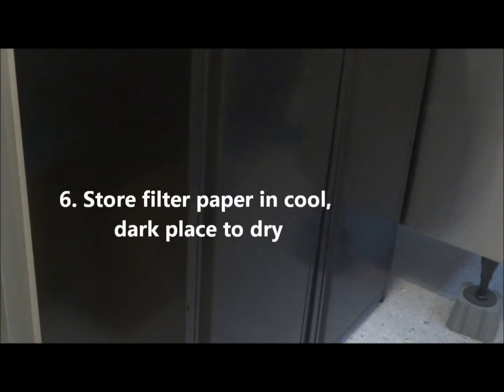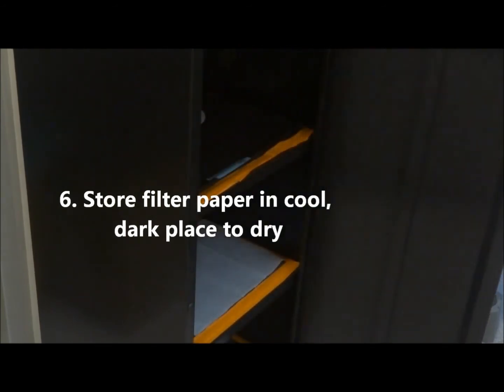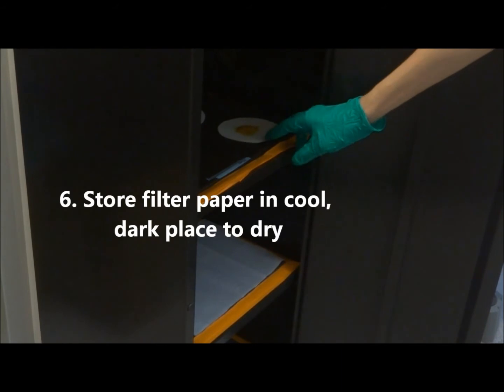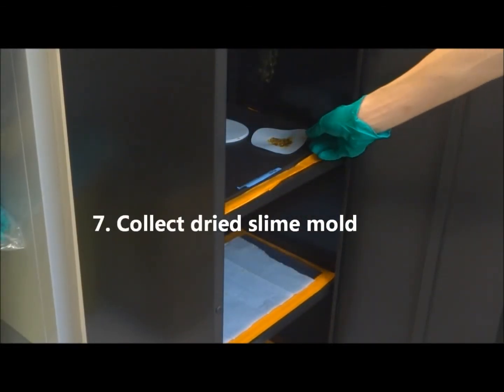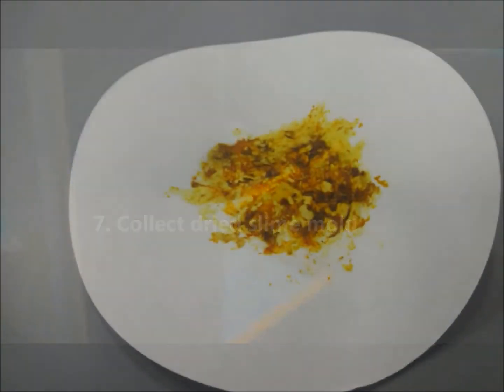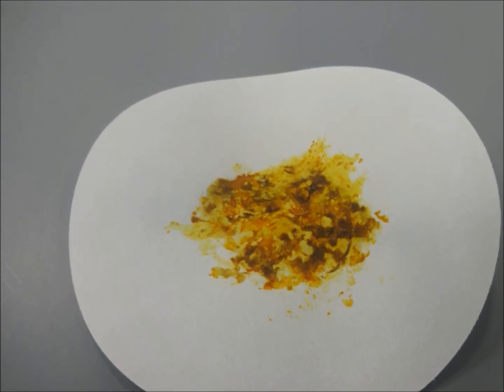Store the slime mold in a cool dark place for about a week to dry. Without moisture, the slime mold will dry out and harden. Collect the slime mold after it is dry. The Plasmodium slime mold is converted into a resting structure called the sclerotium. It should appear crusty and not glossy.